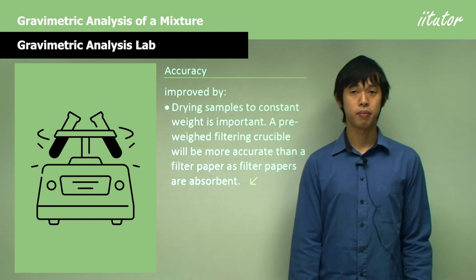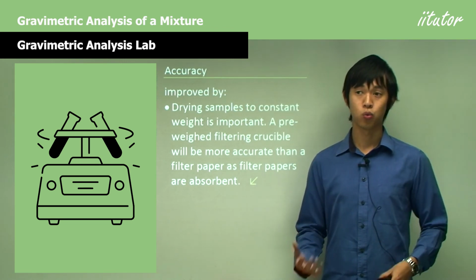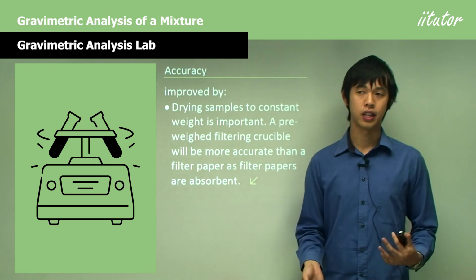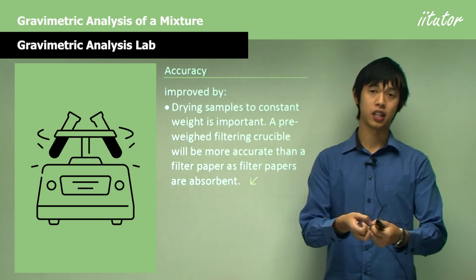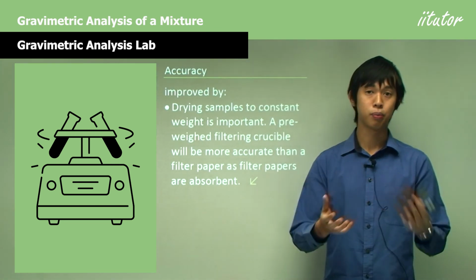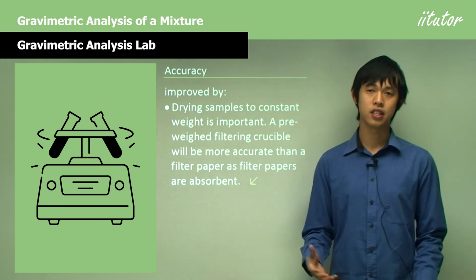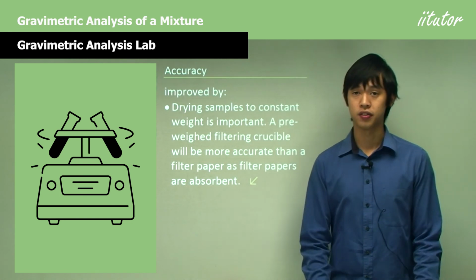That's one simple gravimetric analysis experiment, and hopefully you can understand how gravimetric analysis works and why it's important. It's pretty obvious why it's important because scientists weigh lots of things, and we always want to know compositions of things. It doesn't matter what it is. If we look at the mining industry, we want to know how much of a particular useful metal is in a rock. Or if we're looking at a steel making facility, we want to know how much steel we need to make or how much carbon we need to measure to make the steel. There are lots of industries that rely on measuring things, and those are just two of them. This is why this gravimetric stuff is really, really important.